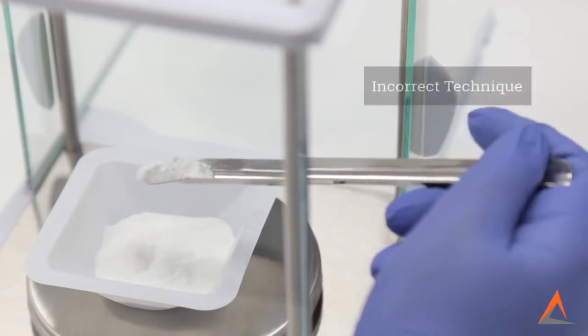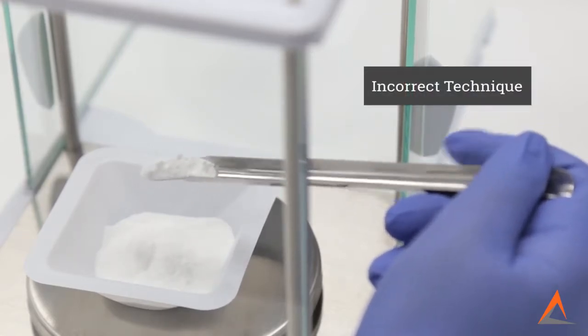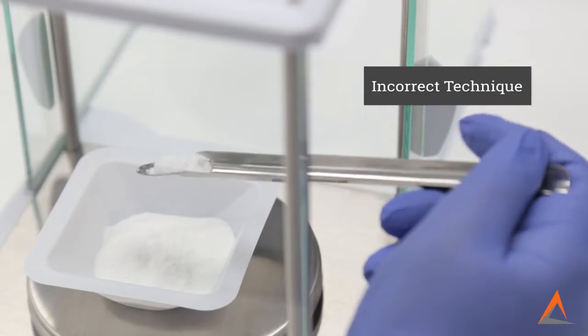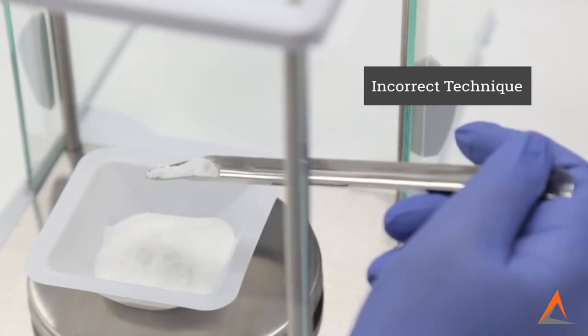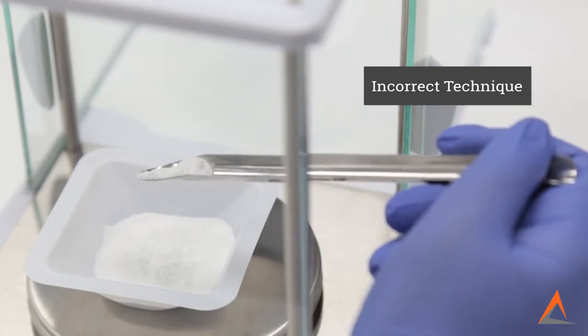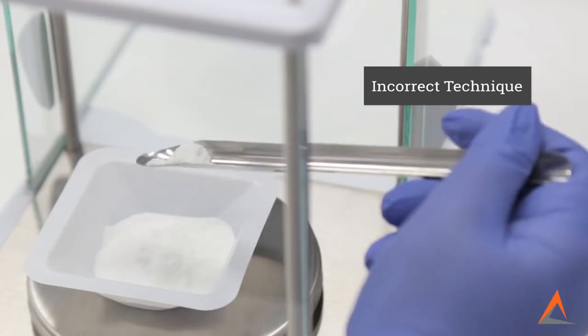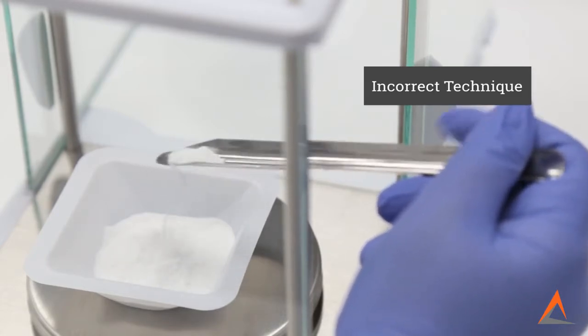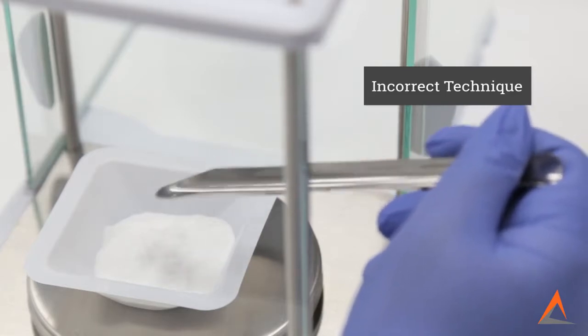When you use your index finger and tap the spatula, the spatula is experiencing a large range of movement and this leads to having less control of the quantity of powder that falls into your weigh boat. Using this flawed technique, it is very easy to add too much powder into the weigh boat and overshoot the desired weight value.